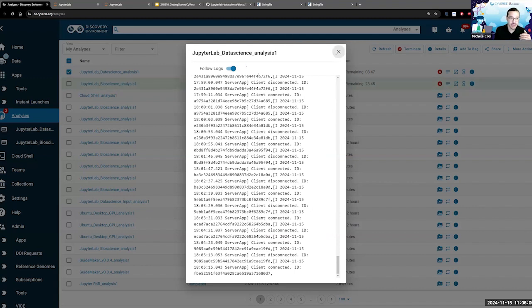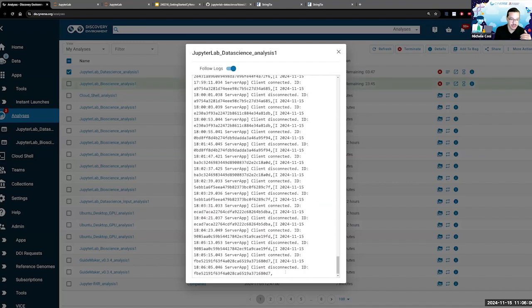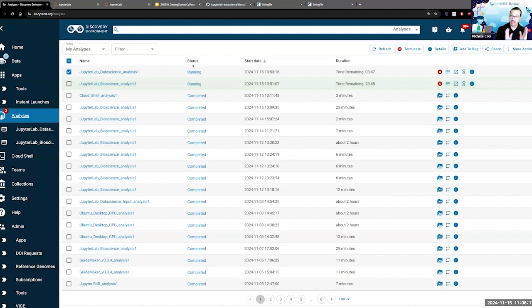But what if... there we go, it's getting refreshed. So I can go ahead and scroll all the way back down to my latest call, and it seems like everything is okay. So nothing is wrong with the current run. I'm going to press X.